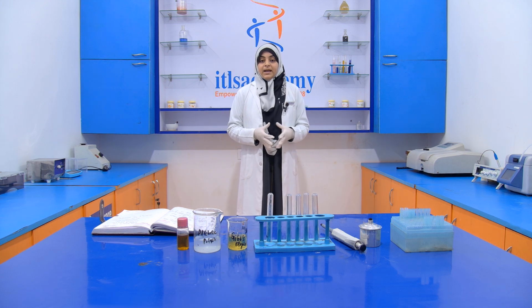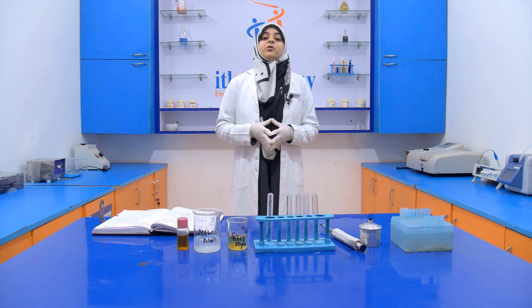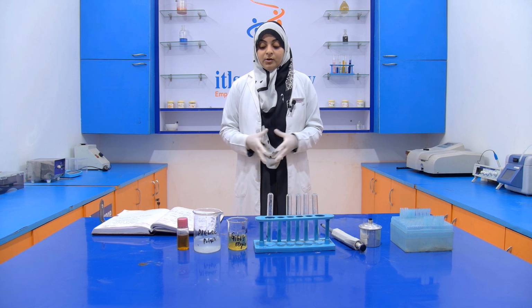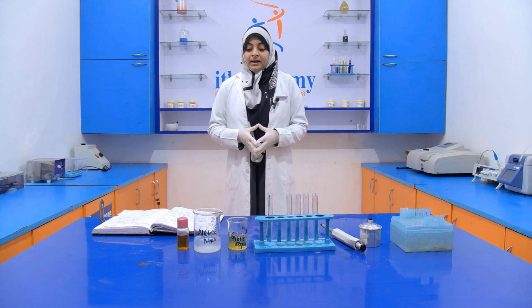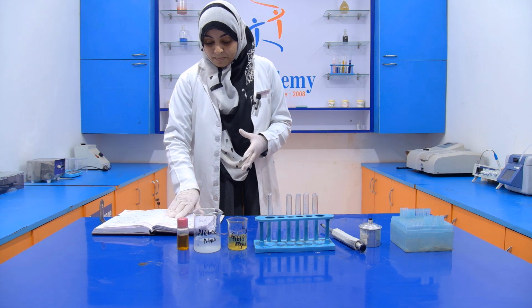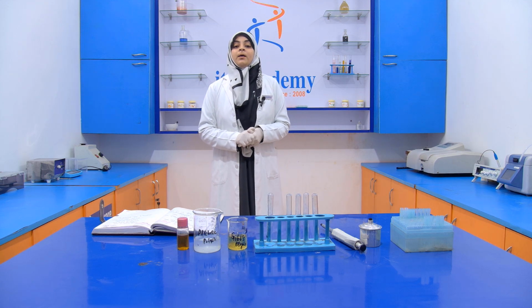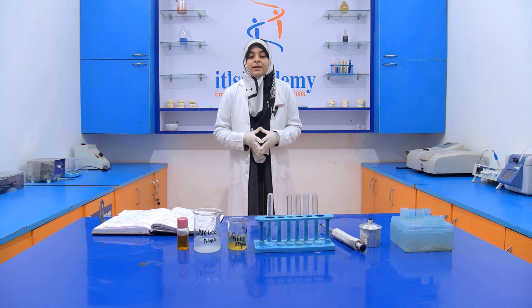When it is completely dissolved, then we add 2 liter of ethyl alcohol. Then we keep it overnight and filter it if required. Then we store it in a plastic bottle. So this is how we prepare this alcoholic potash.